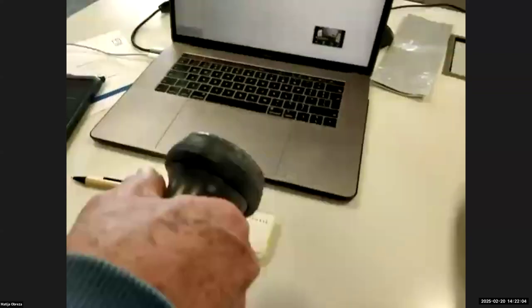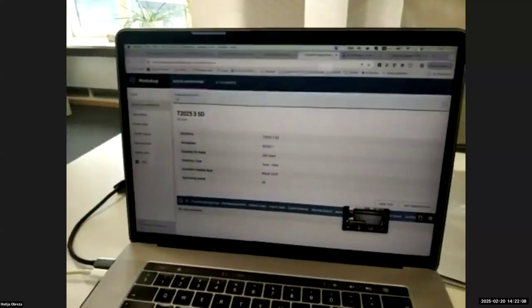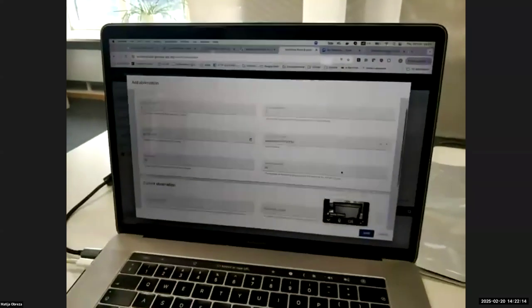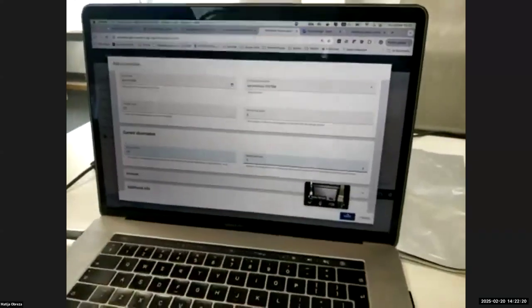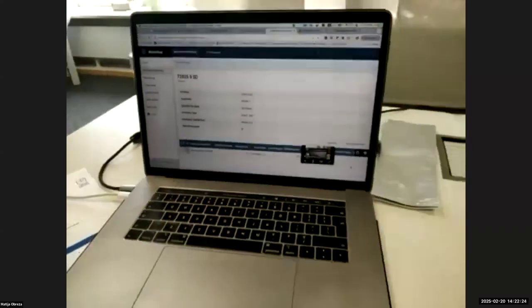Right here. Now, the system allows me to read the barcode and start adding the observation for this test. So quickly, information for a normal. That's all. Now, do you want to do the next one? To click the next one?